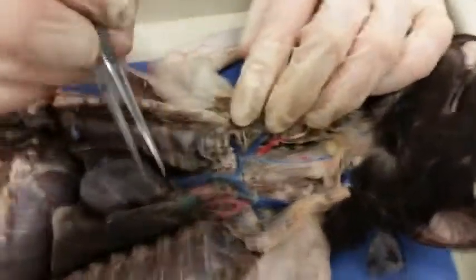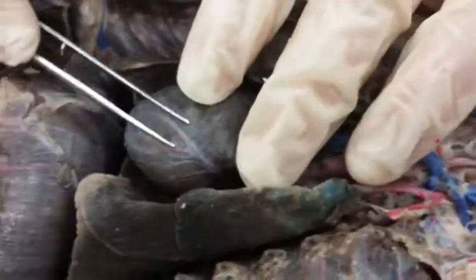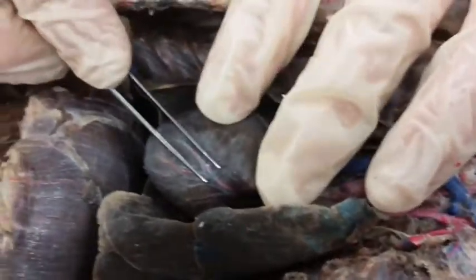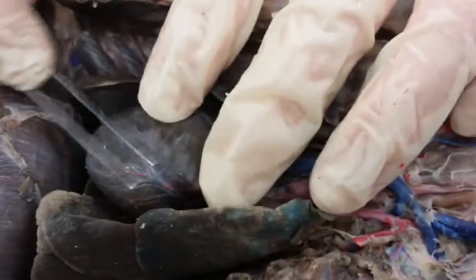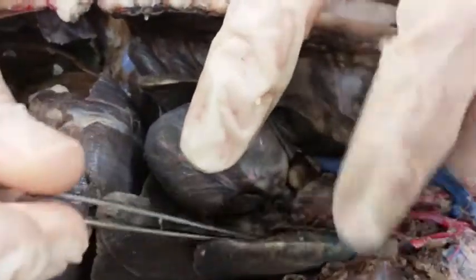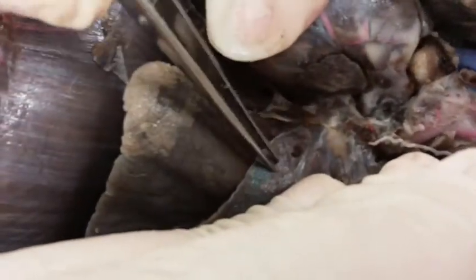To the most beautiful part of our dissection this year. So we'll start down at the heart. As you can see right here, we have coronary arteries and veins on the heart, leading out from the heart and into the lungs. A little bit difficult to see in our specimen just because everything's pretty rigid, but leading out through here, you can see one of the veins right there, will be the left pulmonary artery and vein.